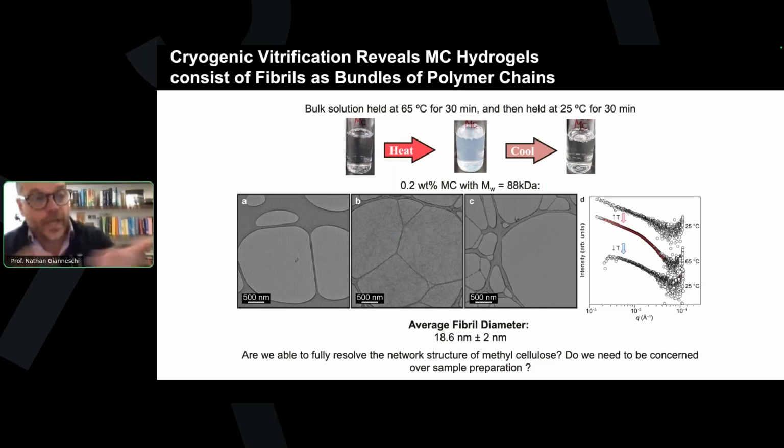We see the same kind of thermal gelation process when we study these by X-ray scattering as well, and that's depicted on this slide. The question we had for this, as I'll describe to you, was simply, is this correct? Is the structure of that gel really these 20 nanometer fibrils or some other kind of architecture?